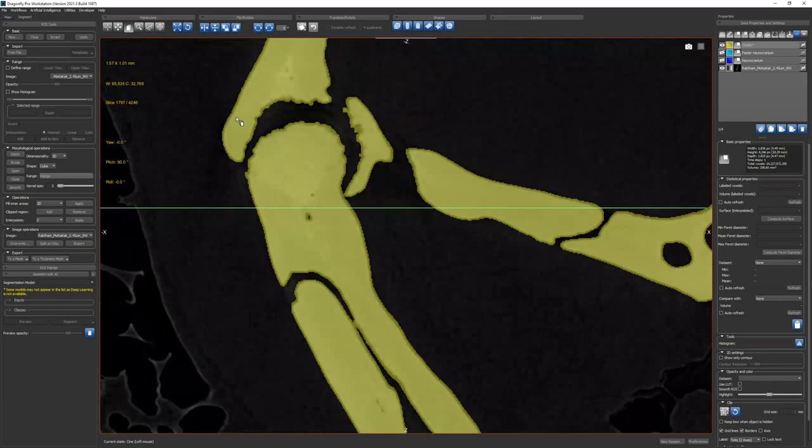And when you see that in 3D, what that will look like is really bright white bone, because you're actually inside bone and you have bone sticking to the structure that you want. So you'll probably have to go and clean that up after.